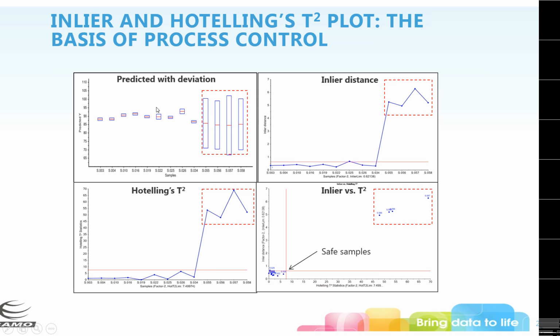So once we took the model and used the one where it didn't include the additive samples, that shows you you can find those very easily. And depending on what you want to do, you might include those data and you might not. So if you want a model that will say, hey, I have something that has this additive in it, you might leave it like this so you can see that there's a difference.